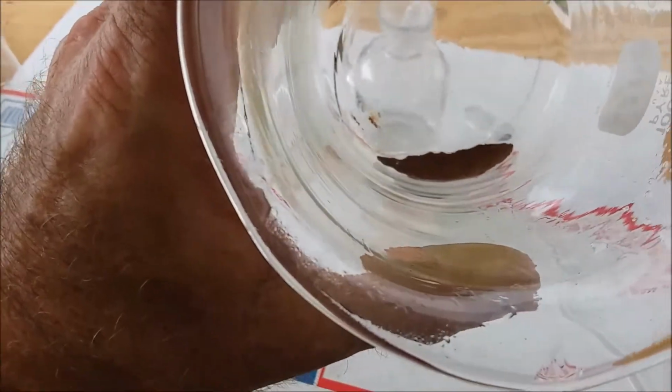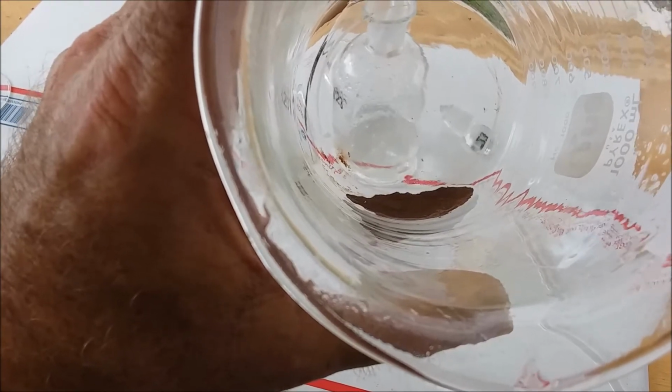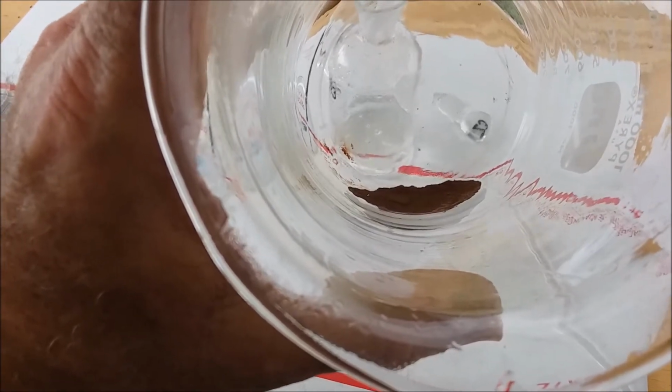Okay, there's the gold down in the bottom of the beaker, and just as I expected, it stayed together. It didn't want to run out. So I'm going to give it a couple washes with distilled water and a wash with hydrochloric acid and a couple more washes with distilled water and see if I can clean it up some.